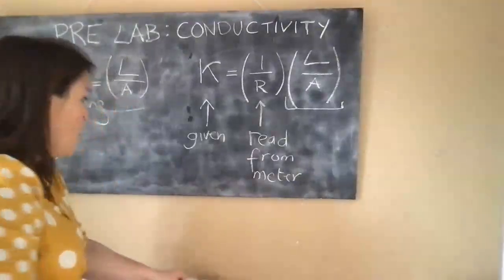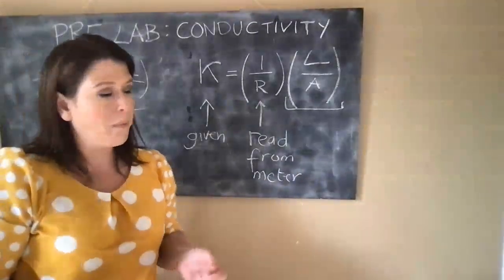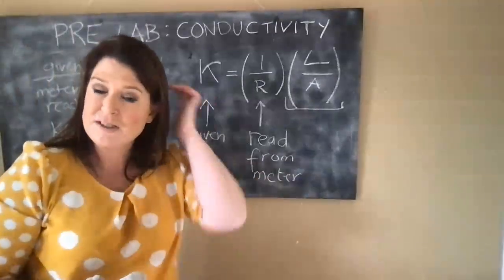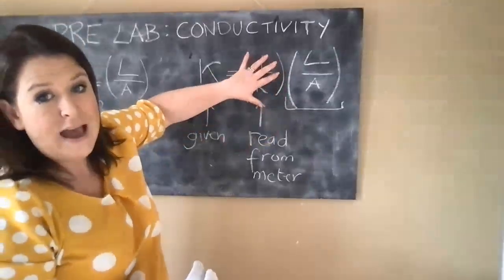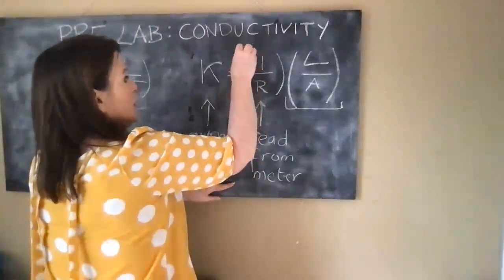Going forward, and I'll mention this in the pre-lab talk as well for part A, every time you take a reading for the various solutions that you're comparing and contrasting, remember that the reading you're getting is only ever a conductance value. That is conductance here.